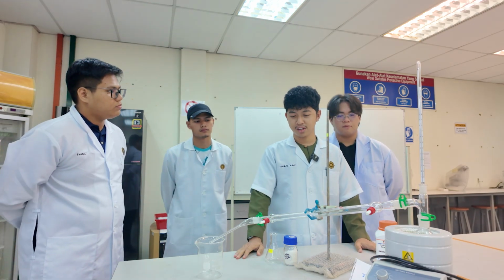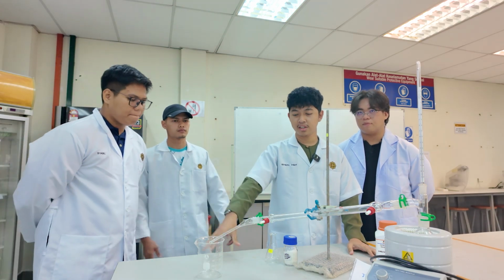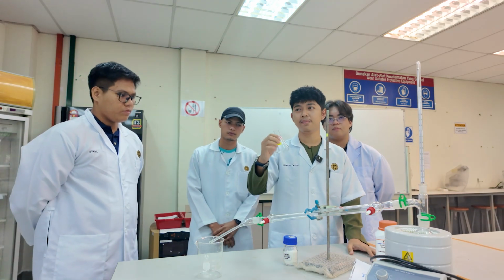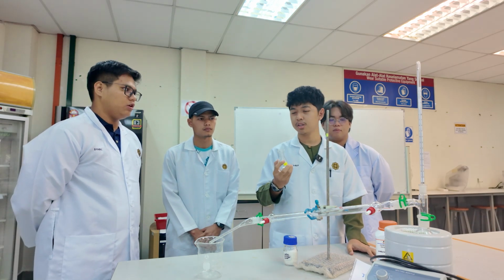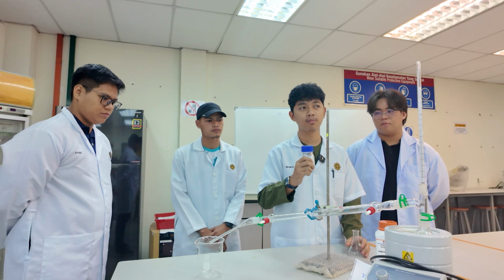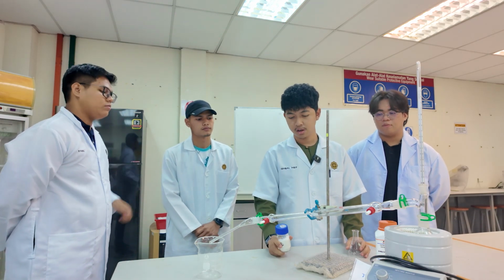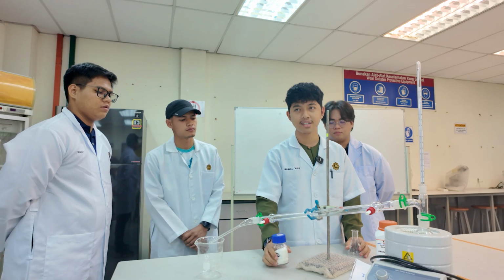Okay, so I will explain about the procedure. After the liquid extraction, we get the extraction in this flask. Before we heat it in the bottom flask, we need to add anhydrous sodium sulfate to remove the traces of water. Why do we need to remove the traces of water? Because the water can interfere with our distillation.